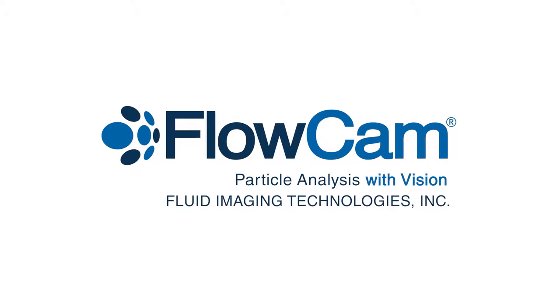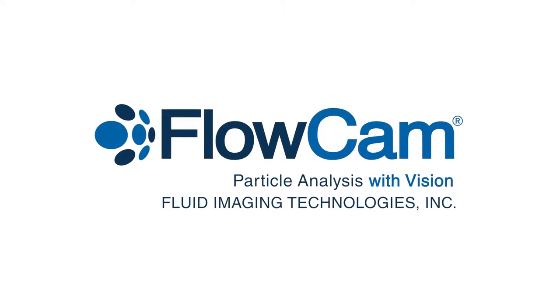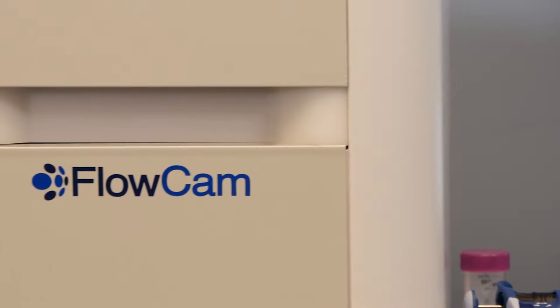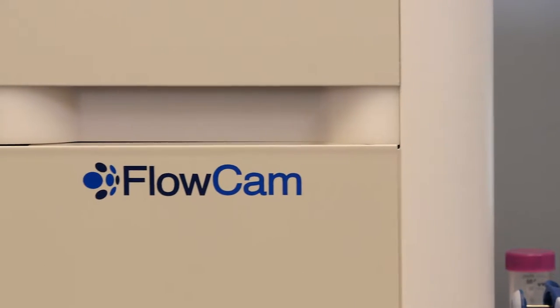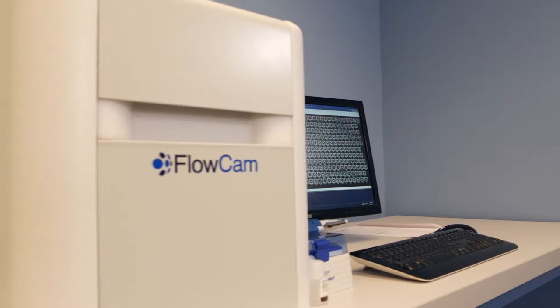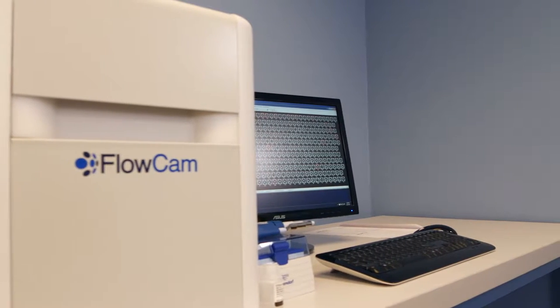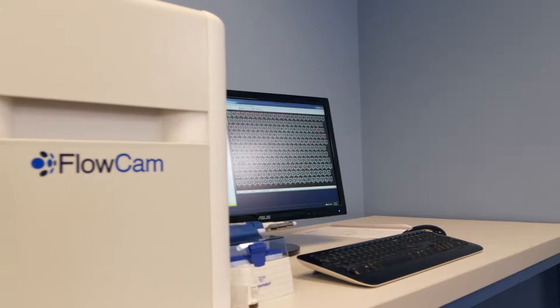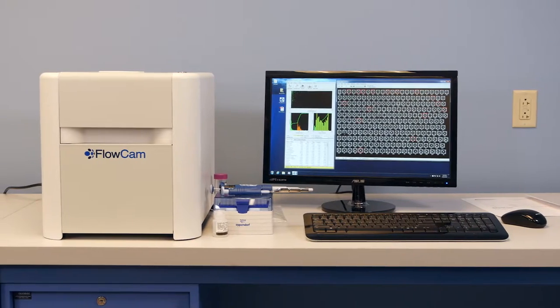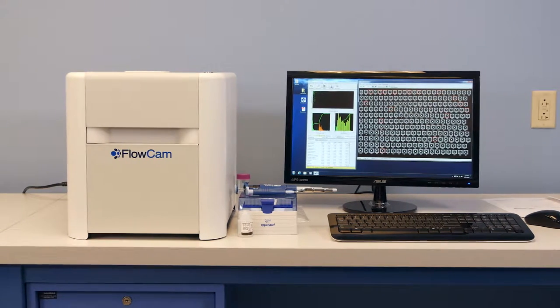Welcome to the instructional training video that will introduce you to your new FlowCam 8100 particle analysis system. Over the course of the next few minutes, we will cover some important information you will need to know for unpacking, setting up, and starting to use your new imaging analyzer.